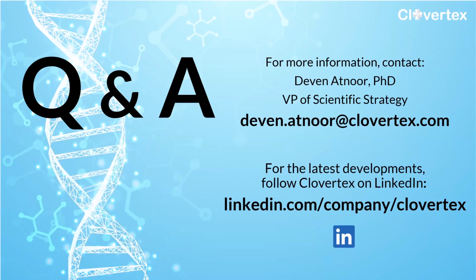Great, thank you. Another from Vadim: how does the DAQ score compare to the MAP-Q score, which was recently adopted by EMDB as the quality measure?